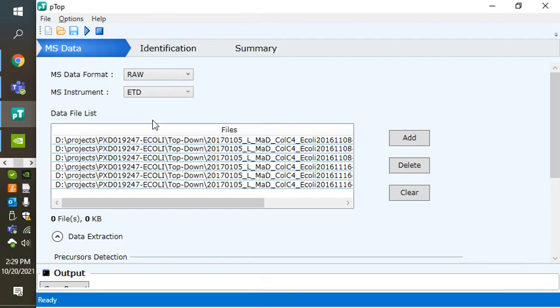Hi there, this is Dave Tabb, and this is the second of my little training videos on how to do top-down proteome informatics. For the purposes of this project, I'm just doing a simple set of 6 raw files that were collected in the Chameau-Roux laboratory here in Paris, France. And I'm going to show you the use of pTop to make sense of these data.